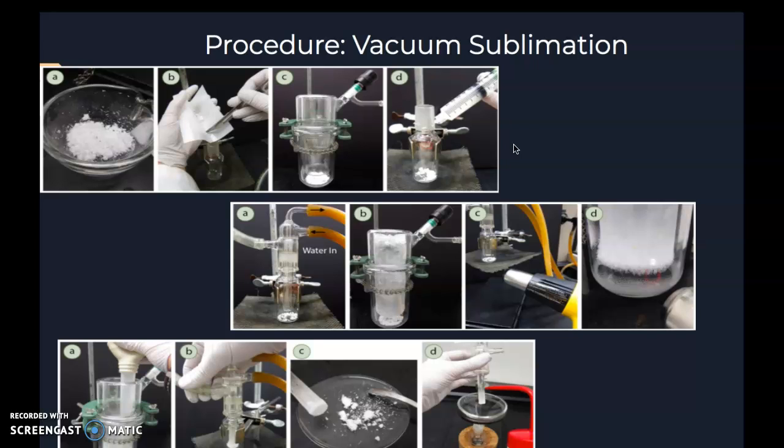Step 7. Heat the solid on a hot plate or Bunsen burner. Increase the rate of heating if the reaction does not begin within a few minutes. In this example that's presented, they are heating the apparatus with a heat gun, but for our lab, it is more practical to use a Bunsen burner or hot plate.